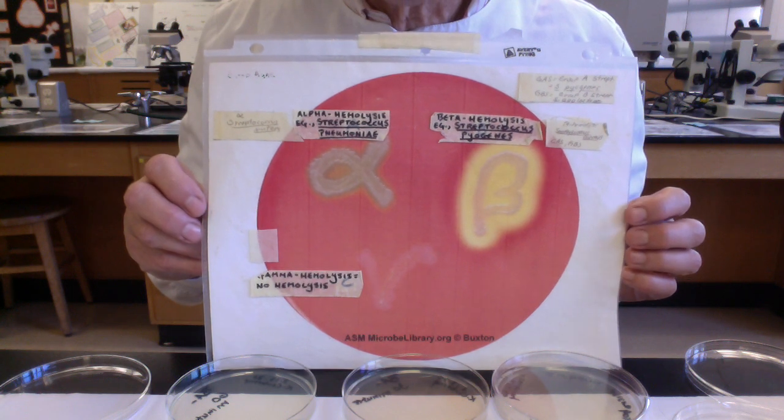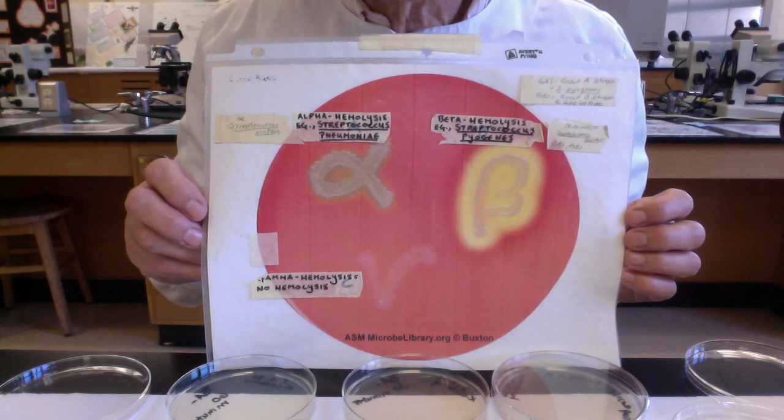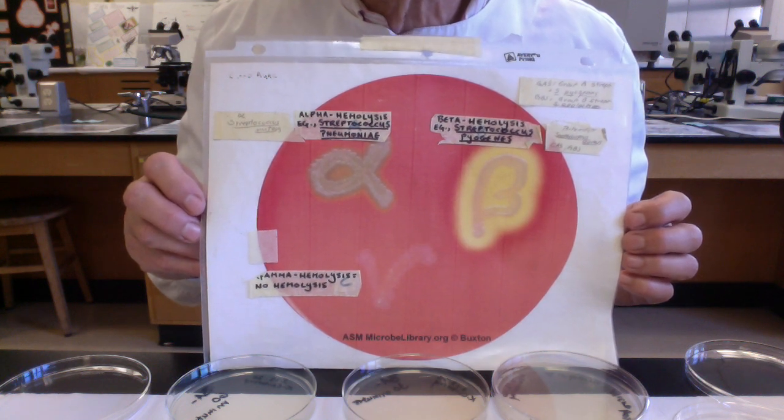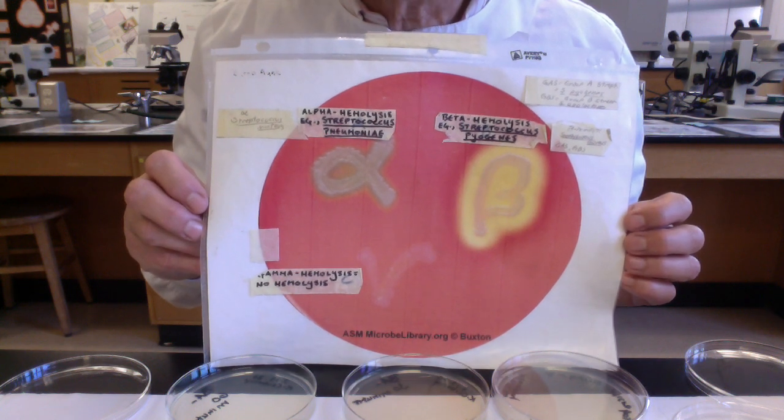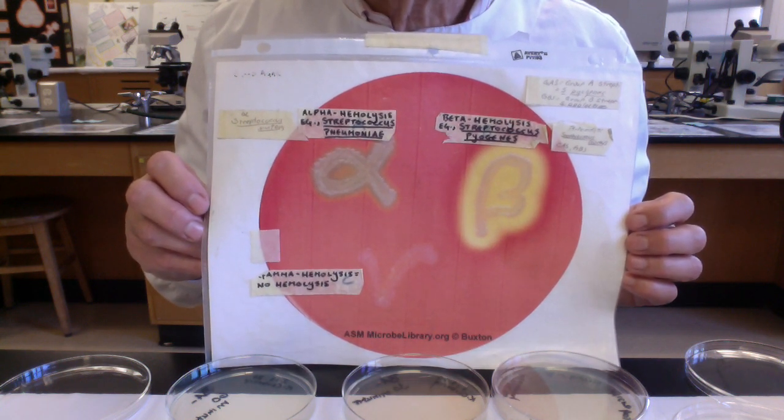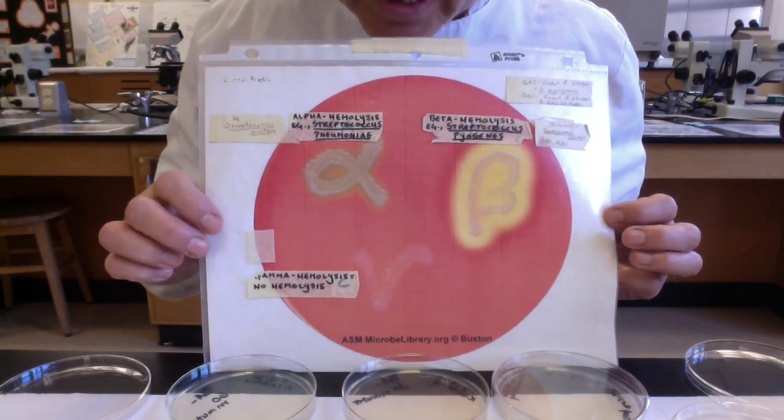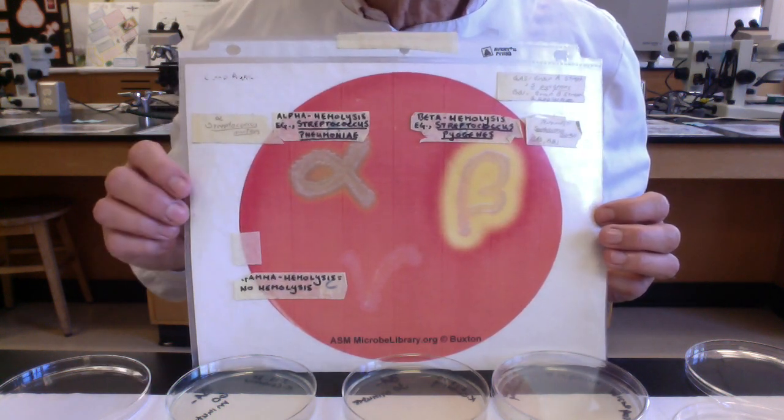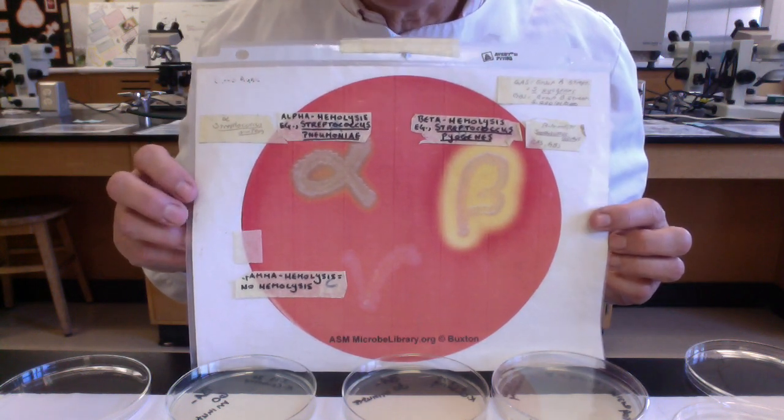So again, folks, the three beta hemolytic gram-positive bacterial pathogens to know: Staphylococcus aureus, Streptococcus pyogenes, also known as group A streptococcus, and then our group B streptococcus, the Streptococcus agalactiae. And then, folks, most microbes, as we said, don't cause hemolysis, so most microbes we would call gamma hemolytic.